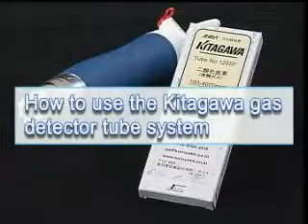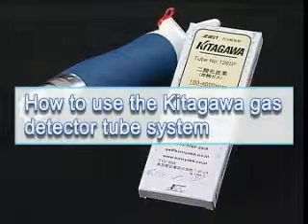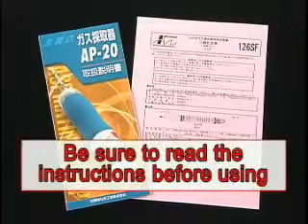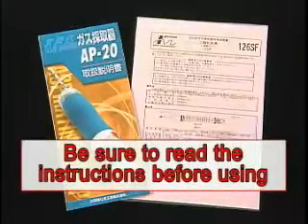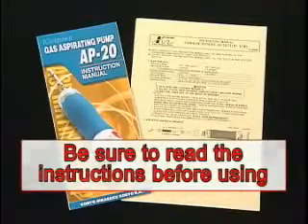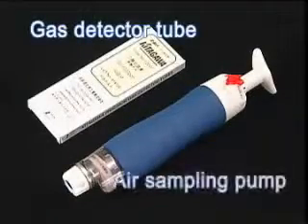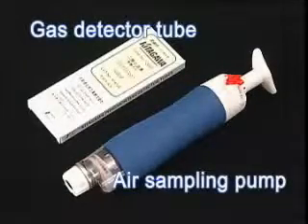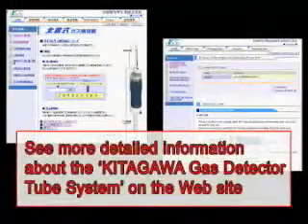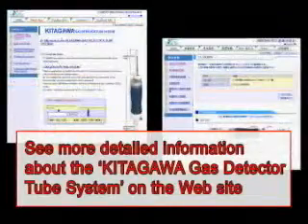The following video shows how to use the Kitagawa gas detector tube system. Be sure to read the instruction manual for the sampling pump, as well as the instruction manual that comes with each box of detector tubes prior to use. There are two parts to the Kitagawa gas detector tube system: the detector tubes and the sampling pump. You can find detailed information for the Kitagawa sampling pump and the many kinds of gas detector tubes on our website.